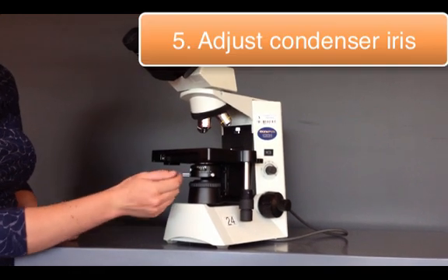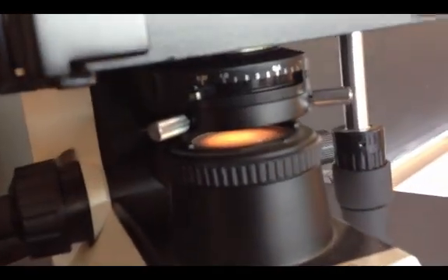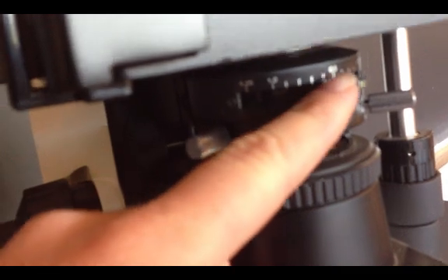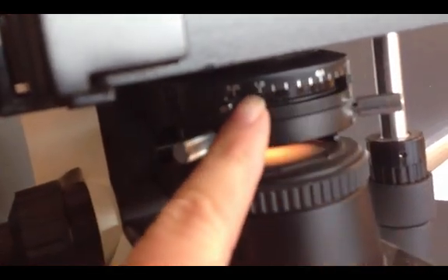Then you need to make sure that the condenser iris is all the way open as well. This is the little toggle switch right here. And you want to put it on the biggest number, which in this case is 1.25.